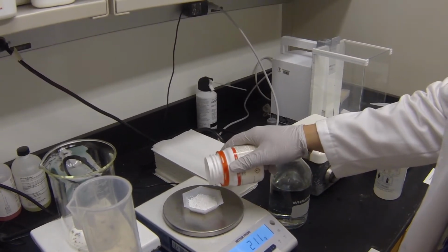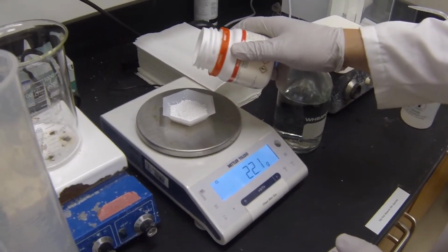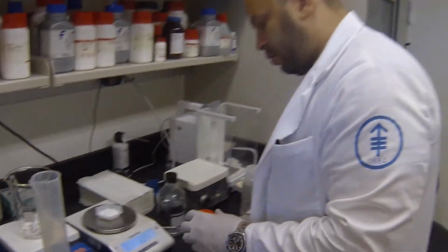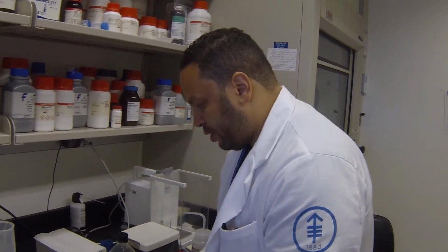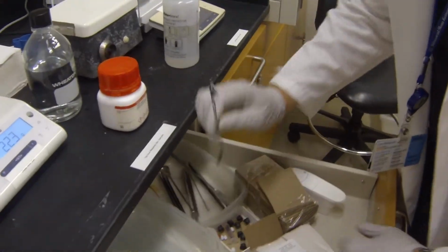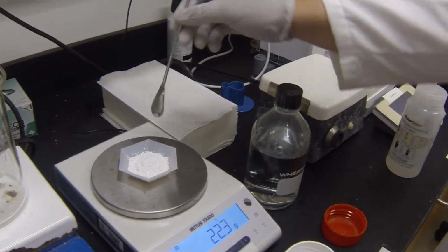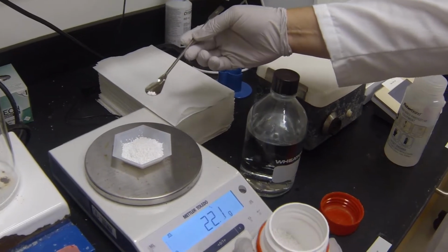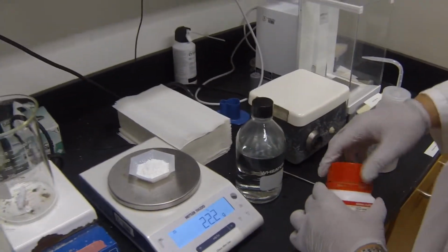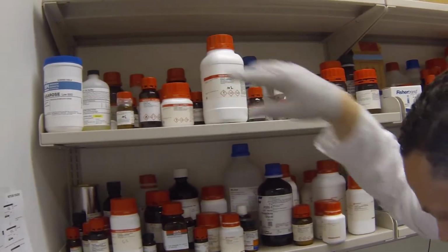We're at 21. 21.2. Let's get a little bit more. Perfect. So now we're a little bit over, but let me scoop some out. I've got a little spatula here. I really shouldn't do this, but hey, I guess we're trying to save money. All right, so now we're perfect at 22.2 grams. We're going to put our chemical back to where it belongs.